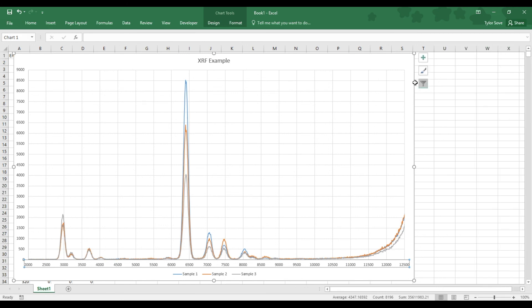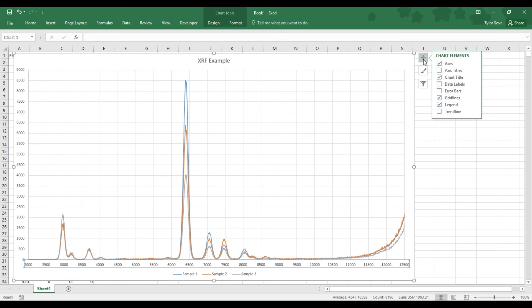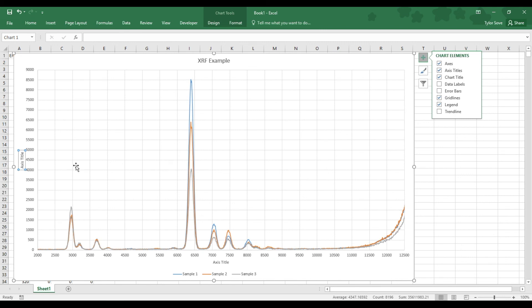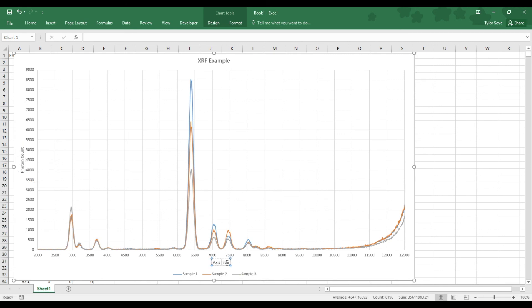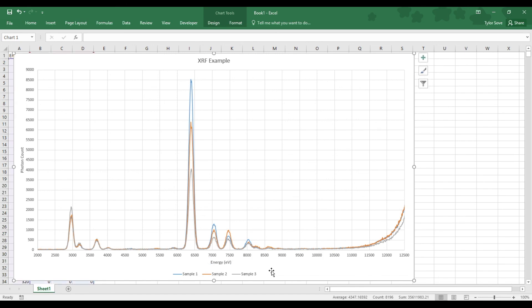Now, the final thing that this graph is missing is axis titles. So if I go up here to the top right, this green cross is the chart elements options, click that, and click the axis titles options. The y-axis is our photon count, the number of photons counted by our detectors. The bottom axis down here is our energy axis. So we can label that energy eV. And there you go, an XRF graph.